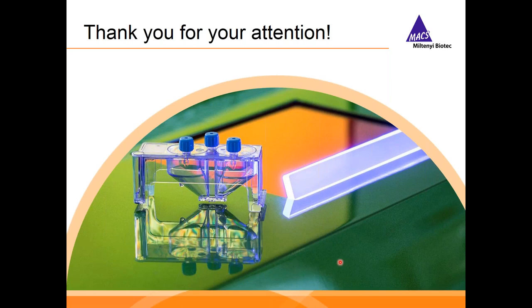Okay, great. We have a few questions about amounts and volumes, like what's the maximum amount of cells that you can sort in one cartridge is a question. So as I said, we had an input volume of 10 milliliters going into the input chamber, and we state a maximum cell concentration of 50 million cells per milliliter, which then sums up with a 10 ml to 500 million cells for one cartridge. It, of course, strongly depends on the application and on the percentage of your cells you're interested in. If you can go really that high, or if you should go that high.